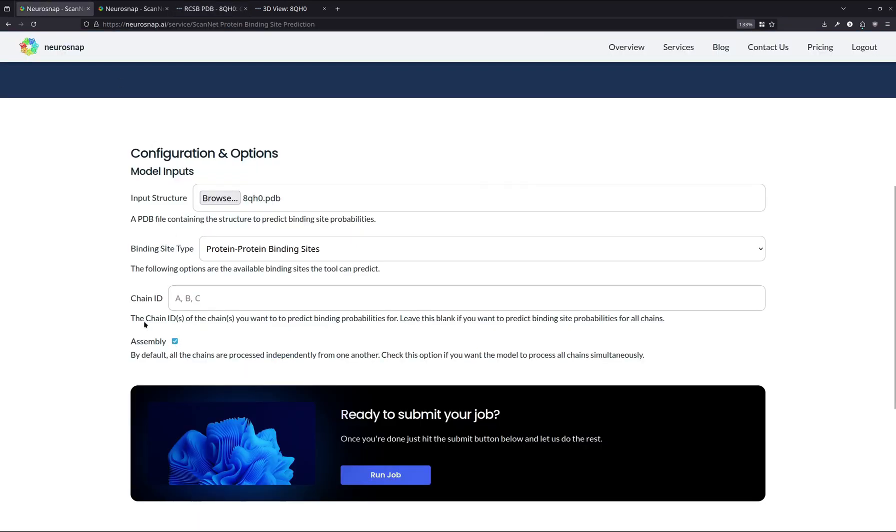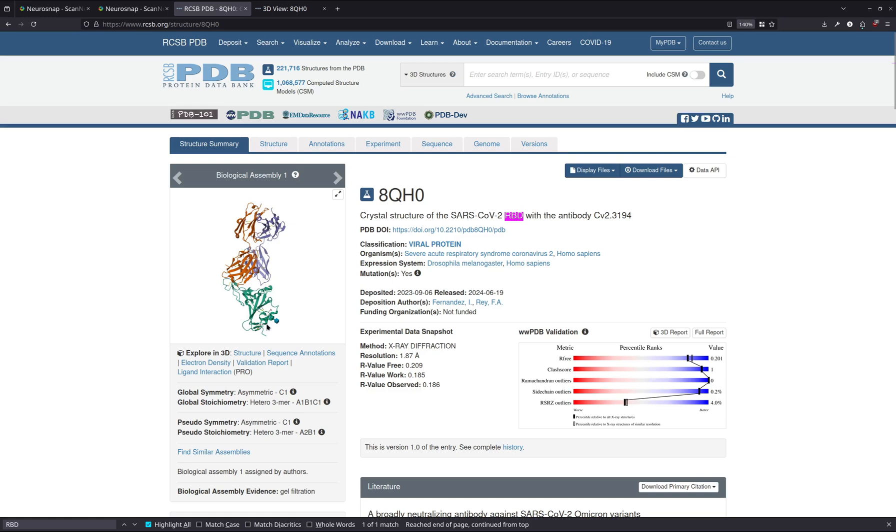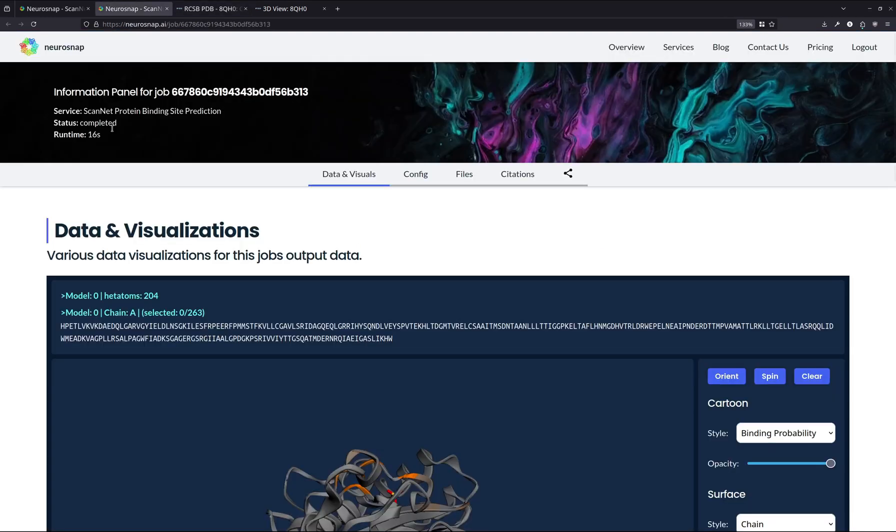However, if we were to keep this option checked, then the model would consider all the inter-chain interactions and it would see the entire structure all at once instead of each chain individually. So this would mean that obviously these chains are already bound, sorry, these residues are already bound to this chain over here, which would mean that the model would not consider them as something that would be interacting with something else. Instead, it might consider something around here. This is a purely hypothetical example or something maybe around over here that is a little bit more free to move around and interact with another protein.